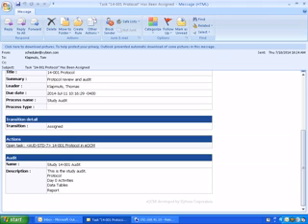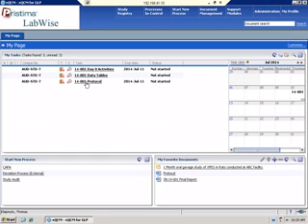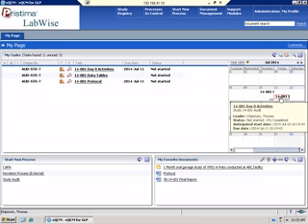Again, it gives you the name of the audit and then the description of the audit. So that goes to your external email and then also onto my page right here. And then it's also on your calendar. When I look at my calendar, I just hover over it and I'll get the details. It gives you not started, percent complete, the assignment date, and when it's due, if there's a due date associated with it.